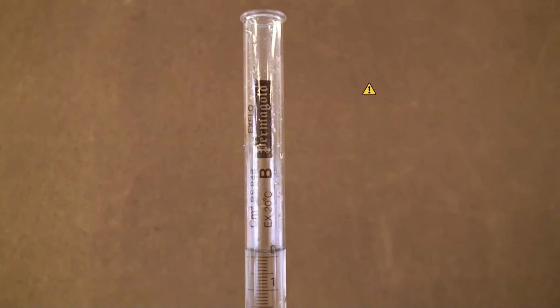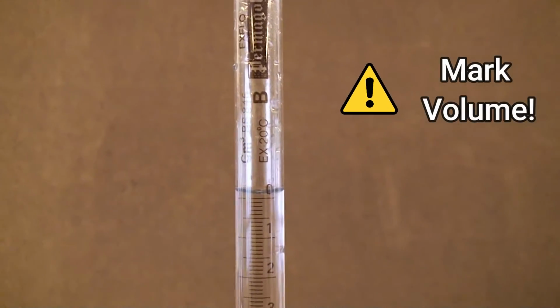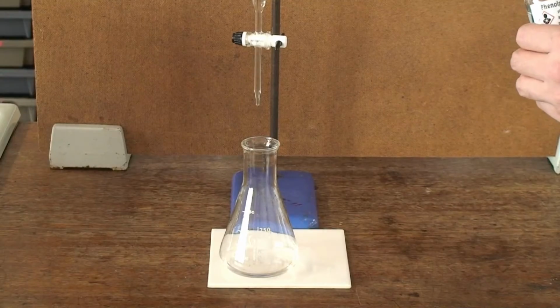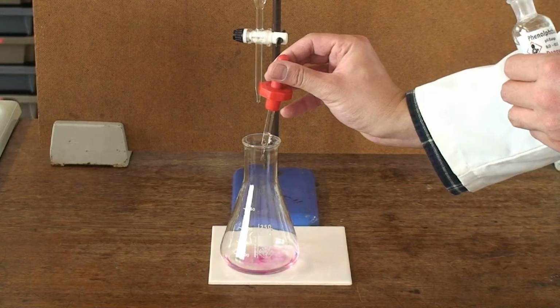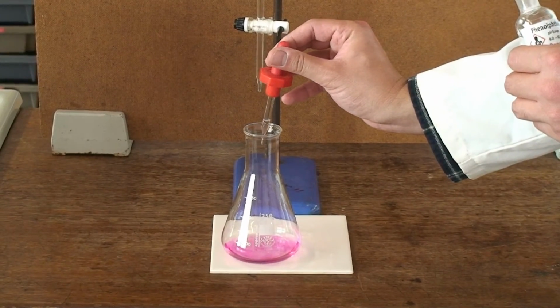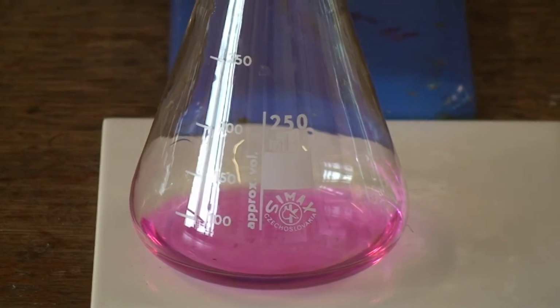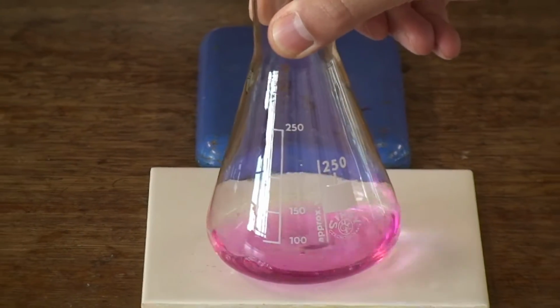Even though it can help to fill the burette with the solution all the way up to the 0 mark, you don't have to, as long as you mind the volume to remember where exactly it was level with. After filling your conical flask with the sodium hydroxide, you have to add phenolphthalein, which results in a pink coloured solution. This will allow us to see the equivalence point, as both solutions are originally colourless.